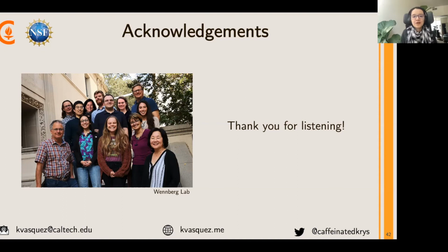It's not particularly a problem. At the end of a GC cycle, we heat up the column to a high enough temperature where everything's either going to be destroyed or just cleaned out in like a big flush of crap, I guess, for lack of a better word. And so we do need to replace it every so often because GCs do degrade, but that's not too big of a deal.